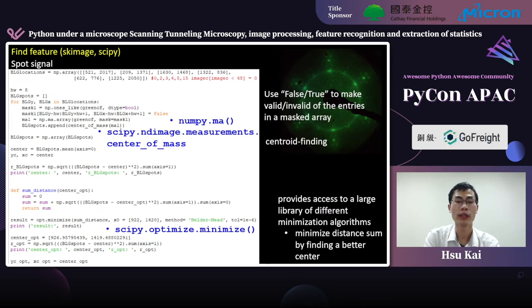So, after blob detection, we can further locate those signals better with the center of mass function from SciPy. Here, I use numpy.ma function to let in only those pixels blob detection returns. And I gave those pixels narrow windows. And then I pass this masked array to the center of mass function. After we have the positions of the signals, we want to find the center of the signals. We want to find the center of those spots. And we also want to find the center of those arcs. Ideally, that should give us the same center. This step is to enable us to do map coordinates later.